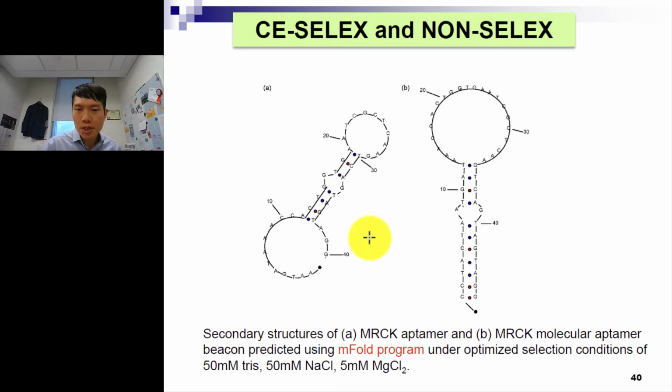Another example: because they are just separated by this hydrogen bond, you can also have an attachment of another aptamer together. It looks like a diamond to you, but I want you to see that it is interacting at the key portion.